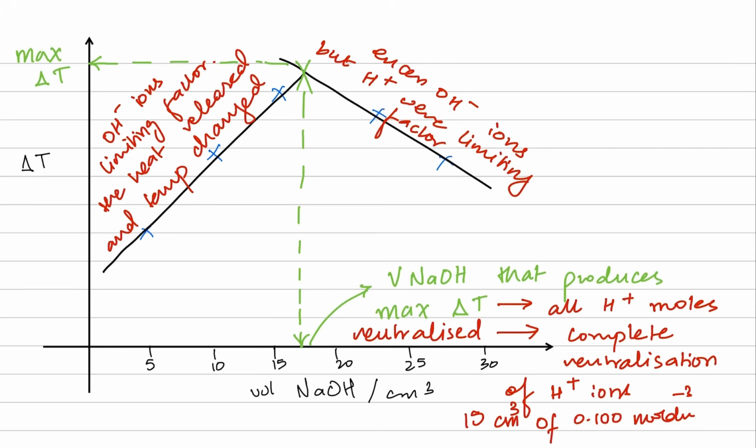This was achieved only through a graph that had two straight lines which intersected each other to give us the volume, which in my case is around 16.5 or like 17ish.